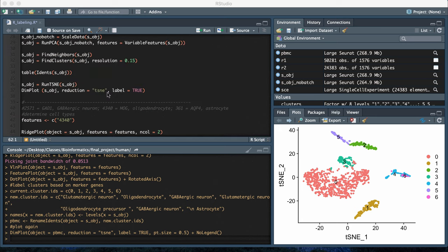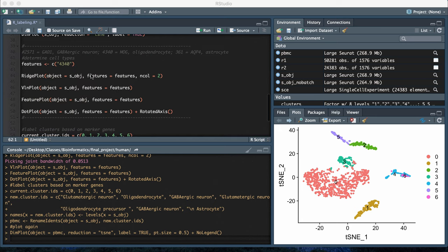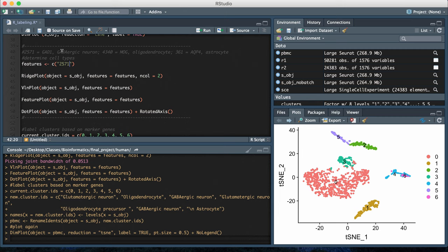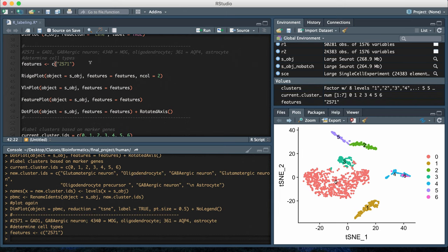Once you have the t-SNE plot that are unlabeled, then what you can do is go through using known genetic markers to test what the different clusters are showing you for the different cell types. I have some examples written down in my notes. I have 2571, which is the gene ID for GAD1, which is a genetic marker for GABAergic neurons.